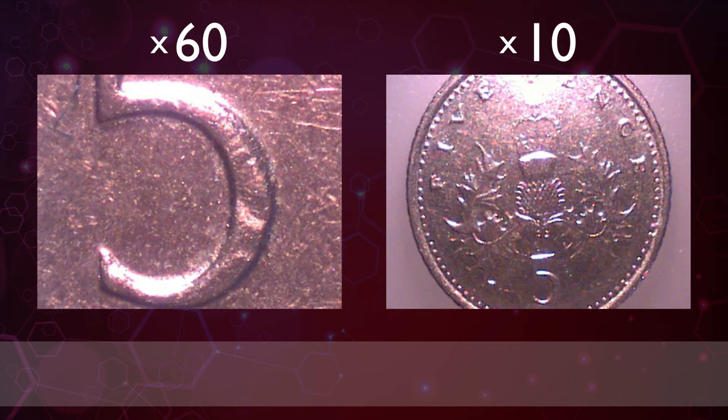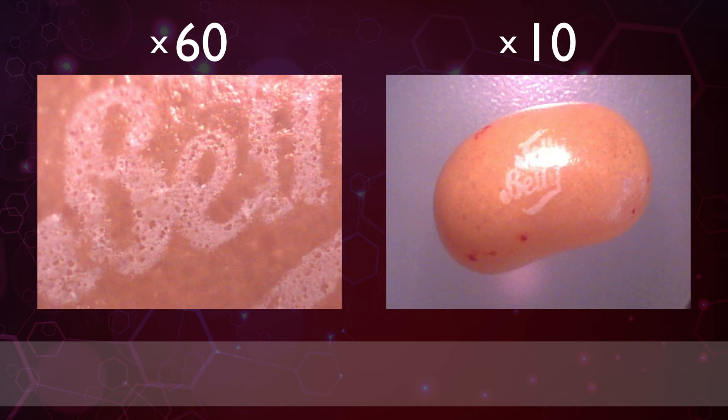The next three objects are things that you can eat. This is number seven. I have a sweet tooth so I'd probably eat a few of these at the same time. Here's the same object at 10 times magnification. It's a beautiful jelly bean.